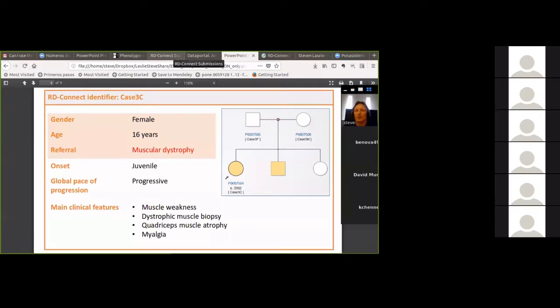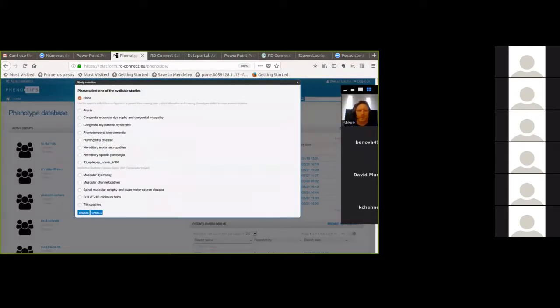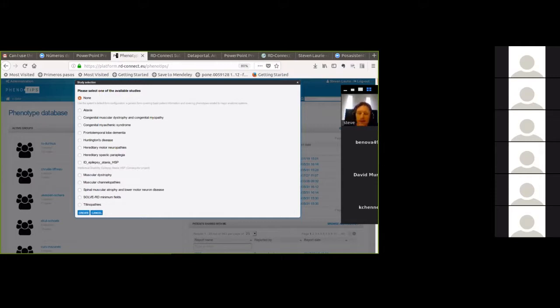If we go into PhenoTips I want to show you how easy it is to create a record for this individual. You create a new patient — and if I go through anything too quickly today, hopefully you'll be able to go back and watch the video again. So you create a new patient and then we have a number of templates that we've designed for historic projects, particularly with a neuromuscular focus.